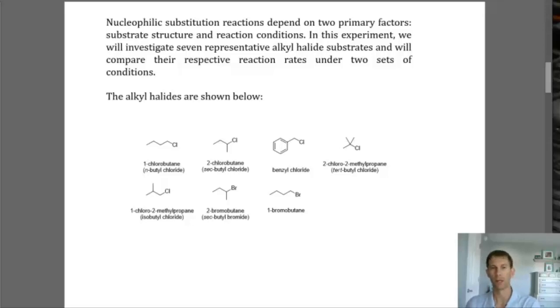In this experiment, we're going to use these 7 different alkyl halide substrates and put them under conditions. So for the first part of the experiment, we're going to put them under conditions for an SN2 reaction. For the second part of the experiment, we're going to put them under conditions for an SN1 reaction.